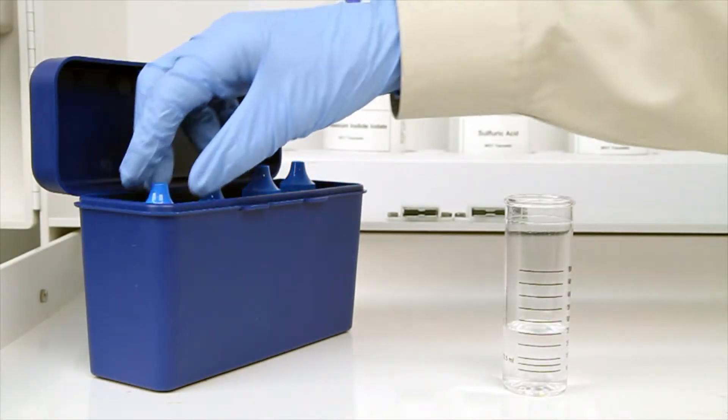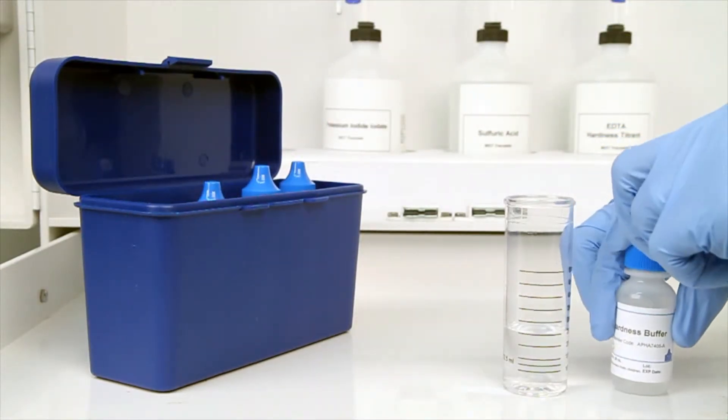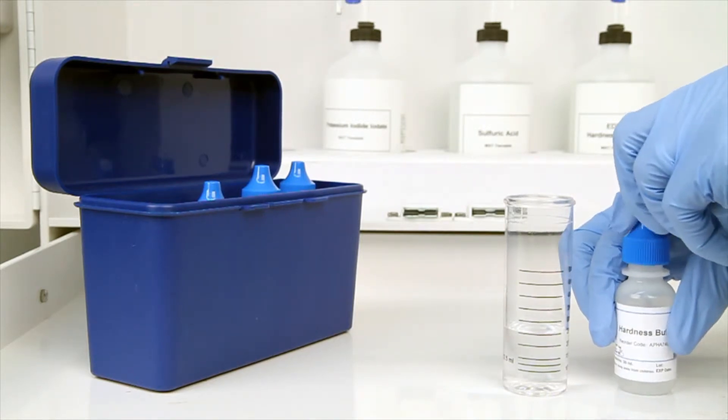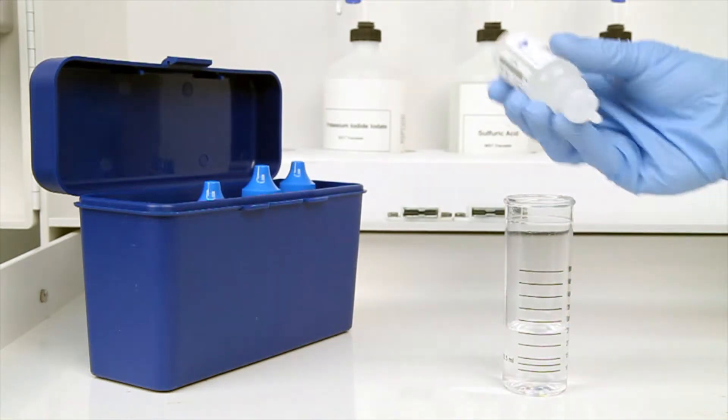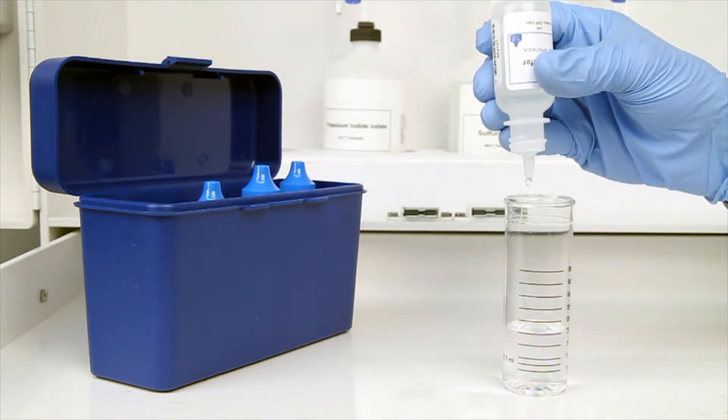The next step according to the Endpoint ID procedure is to add five drops of hardness buffer. Be sure to hold the bottle vertically to get a consistent drop size.